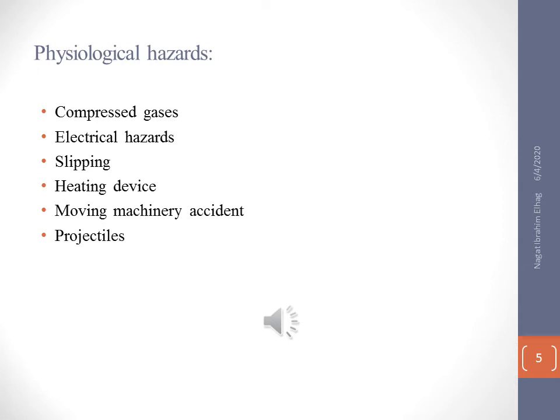And when you leave your lab, make sure you have not left those devices on, to avoid any fire in your lab.